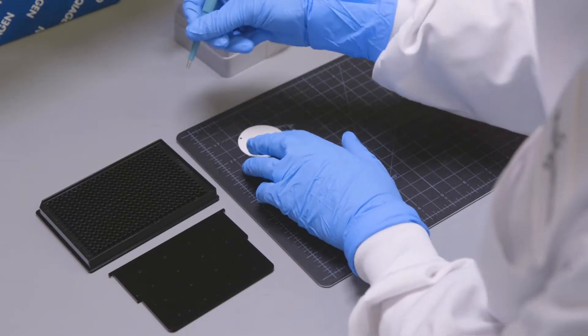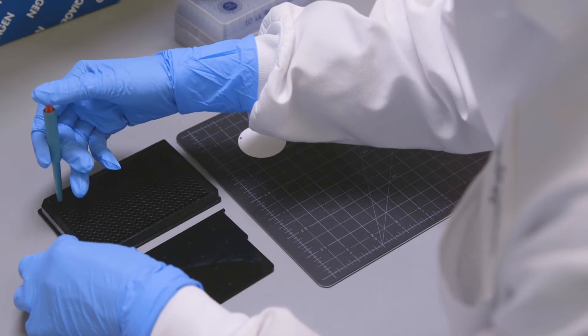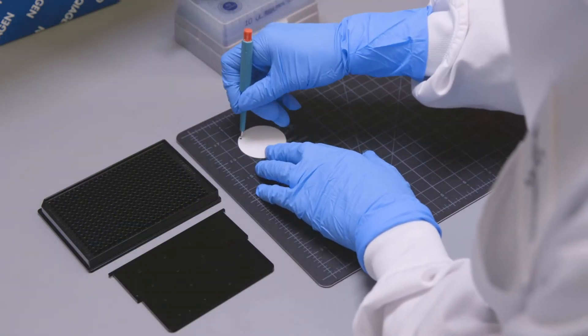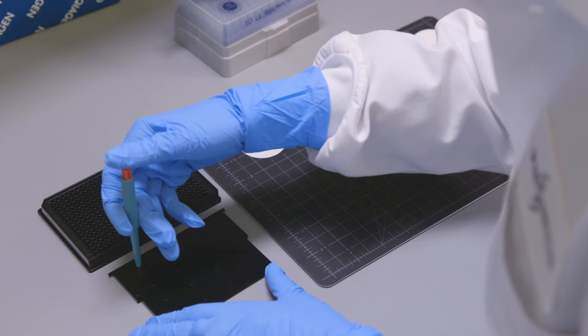The first step is to cut the paper. We use a biopsy punch to cut out paper disks, which can be placed into a 384-well plate or a cartridge for the electronic reader.